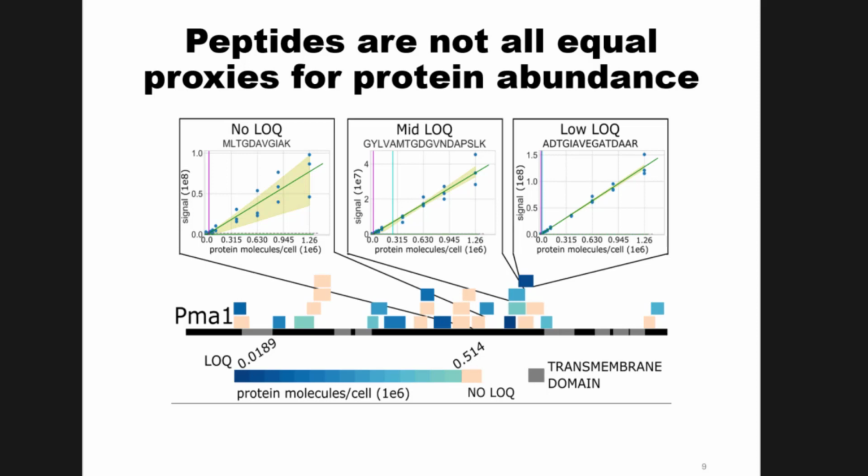So you didn't take just this protein and digest it? Nope, the whole lysate. Yep. Then probably this is because that peptide was similar to, or came from, other proteins. It might be. With yeast we don't have quite as bad a problem with isoforms. There's not a lot of splicing in yeast, but homologous proteins might have shared peptides. But it's a combination. It sets me up perfectly.